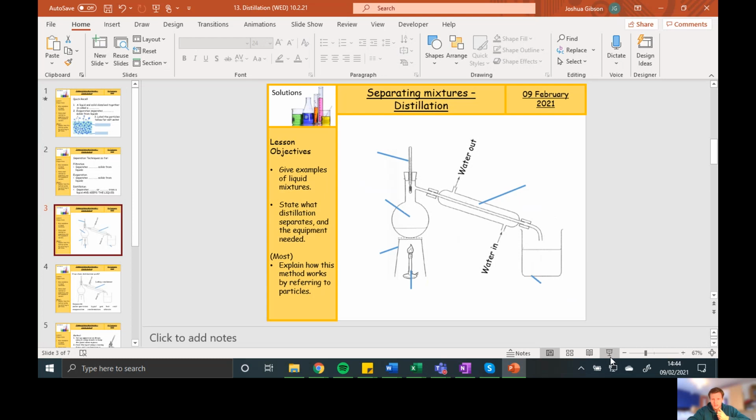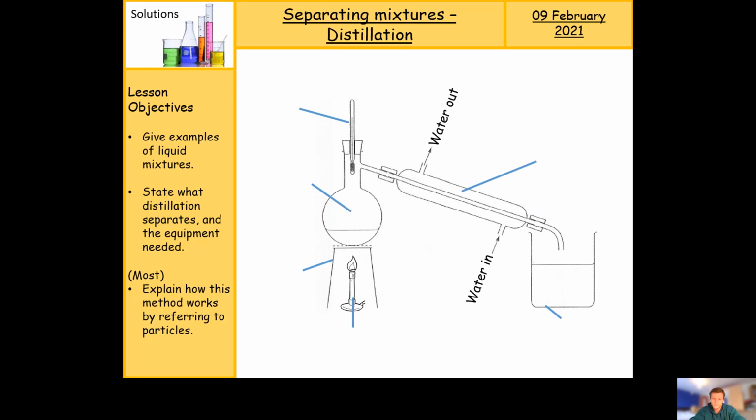So let's go and have a look at what distillation is doing. And so this is the bit I was promising you. This is the crazy scientist bit where you have Bunsen burners going over here, a round glass beaker over here, thermometers sticking out of everywhere, and you have this special tube, and this tube ends up having little pipes coming out of it for water, and then you get a little drip, drip, drip down here, like you see in the movies.